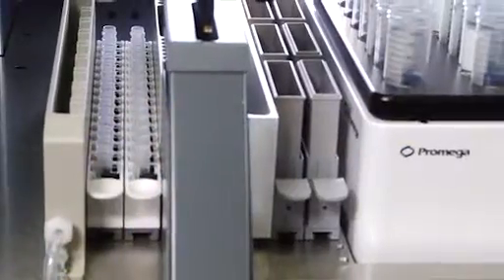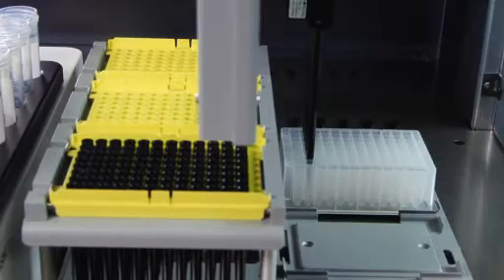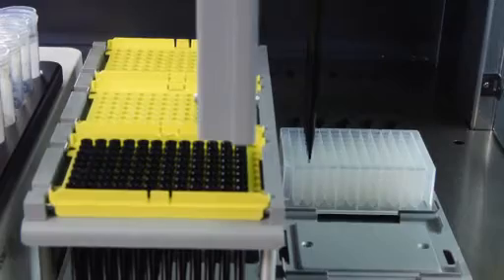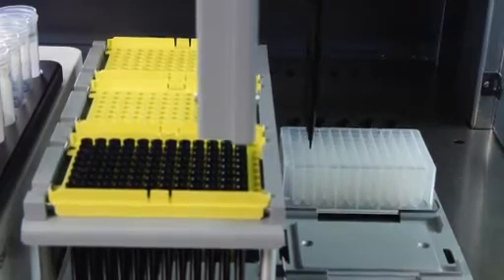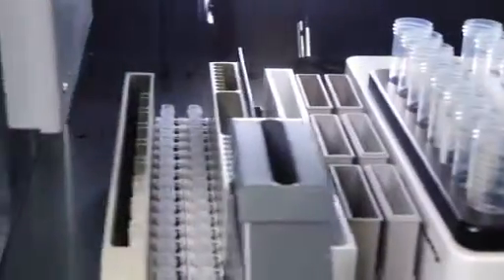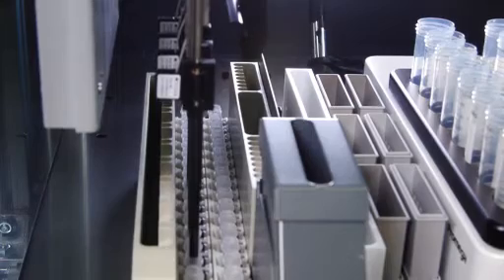After transfer, samples are ready for quantitation, storage, or downstream applications. Robust automated chemistries can reduce operator hands-on time.